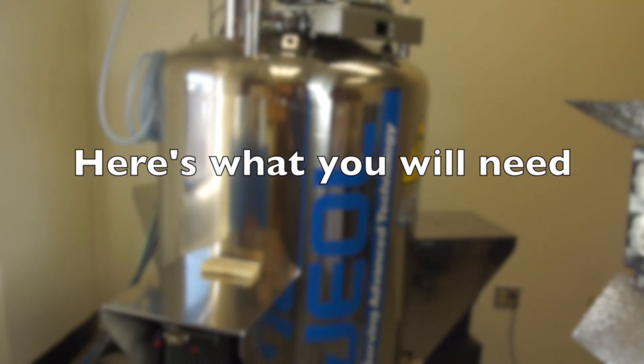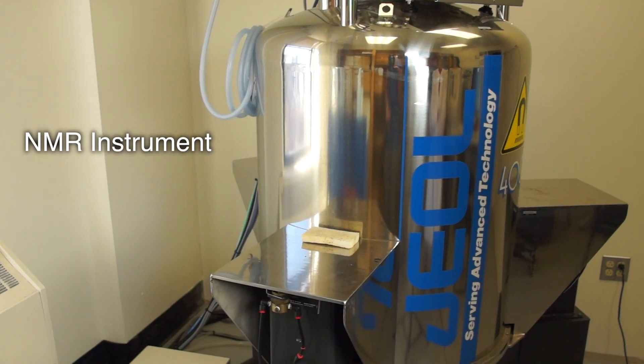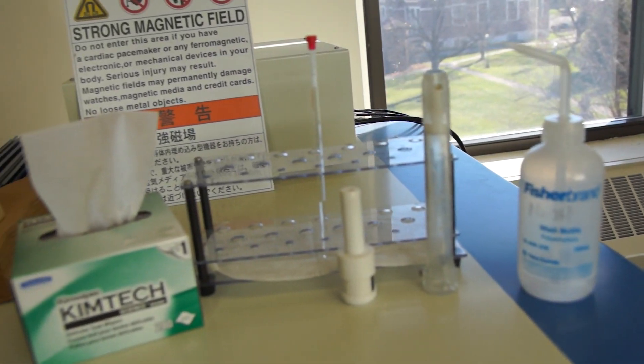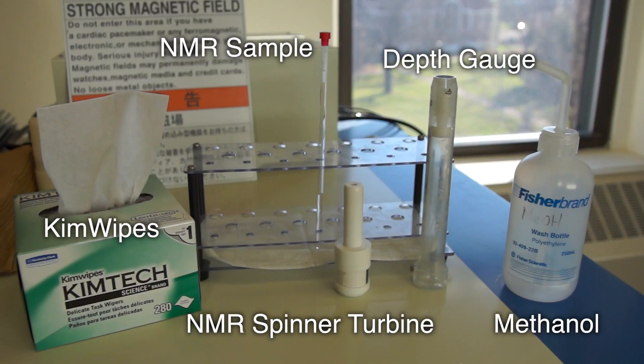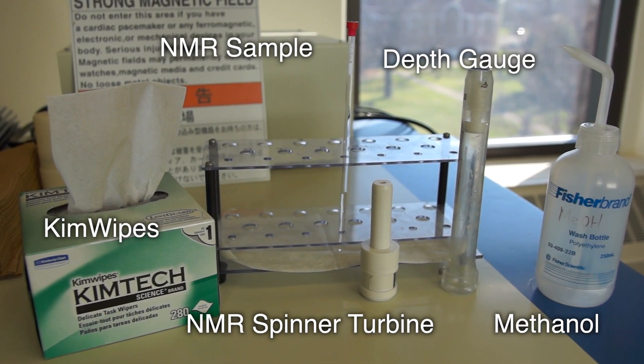To load an NMR sample, here's what you'll need. The NMR instrument, as well as your NMR sample, depth gauge, some kim wipes, an NMR spinner turbine, and some methanol.